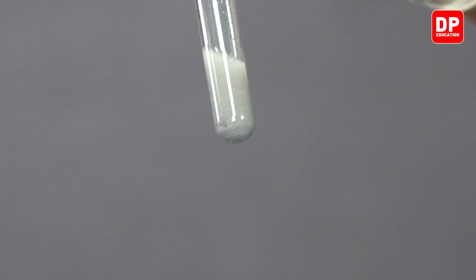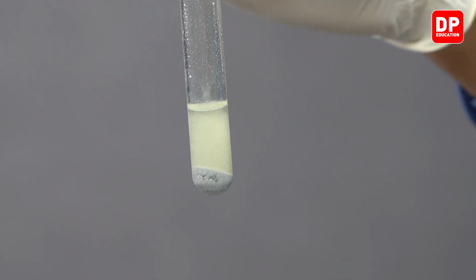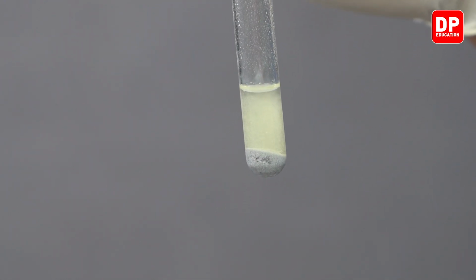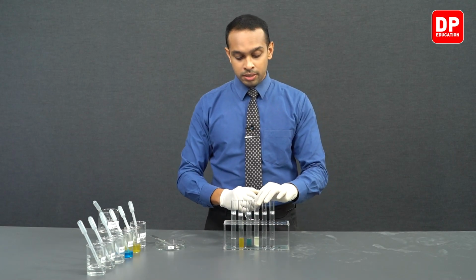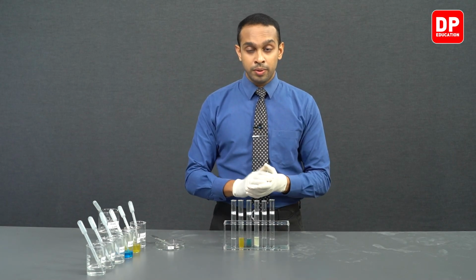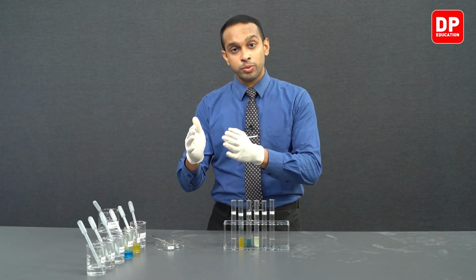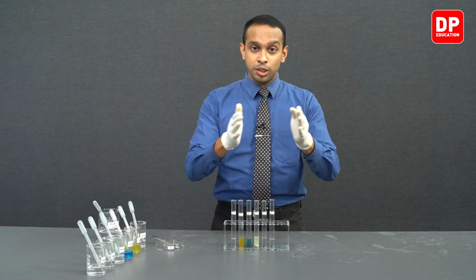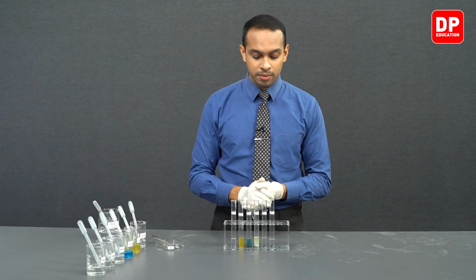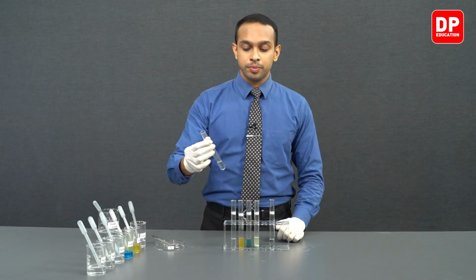This precipitate is basically the lead metal that is displaced in the presence of zinc metal. Again, just to repeat what I just mentioned, the zinc metal gets oxidized to form Zn2+, while the Pb2+ aqueous ions get reduced to form lead solid. Now let's move on to magnesium.